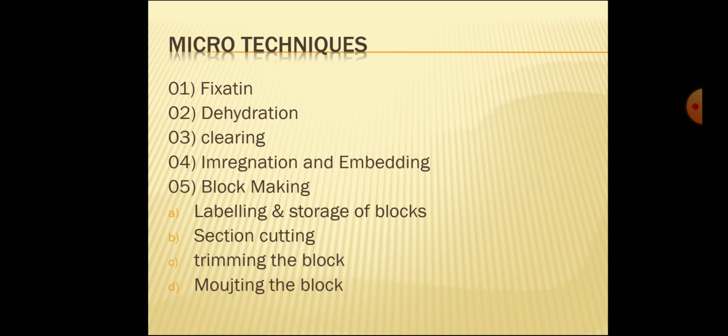In case of high humidity in the weather, the specimen tube should be kept in a desiccator, and during staining, there should be a sufficient quantity of stain in the jars so that the slide is completely immersed. In such a way, dehydration takes place, water is removed, and the tissue becomes completely dehydrated.